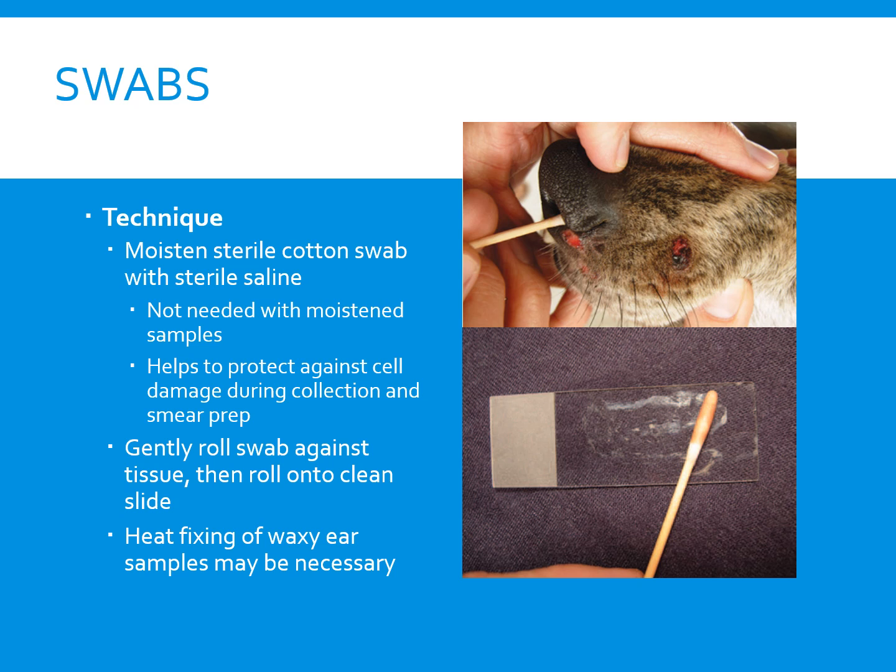The swab should not be rubbed across the slide surface because this causes excessive cell damage, so it's a gentle roll. Ear swab samples may contain excess amounts of wax, and this may interfere with the evaluation of the sample. So to minimize this effect, gentle heating of the slide or heat fixing may be necessary.